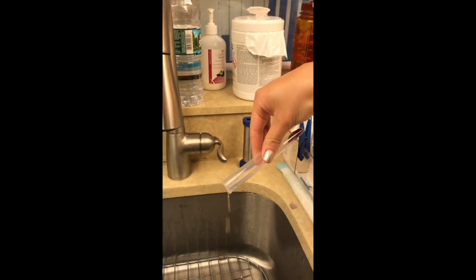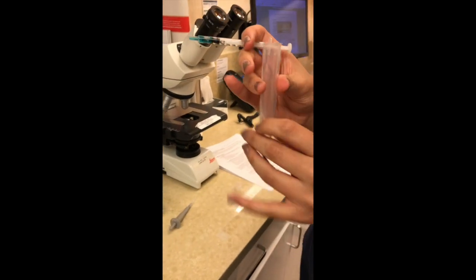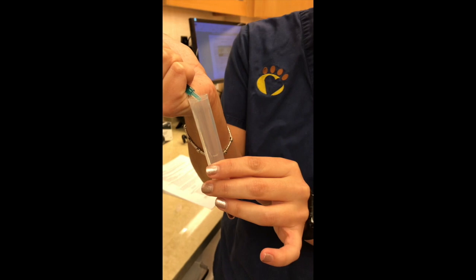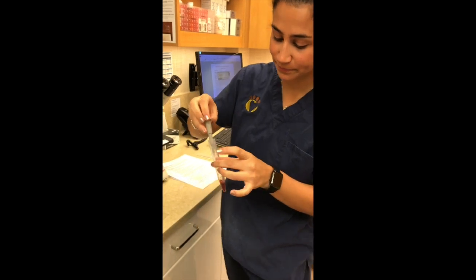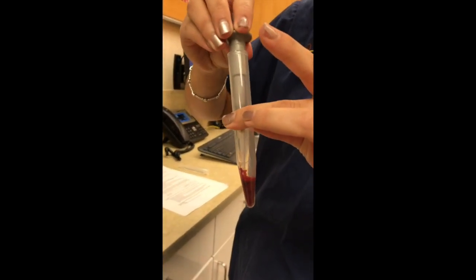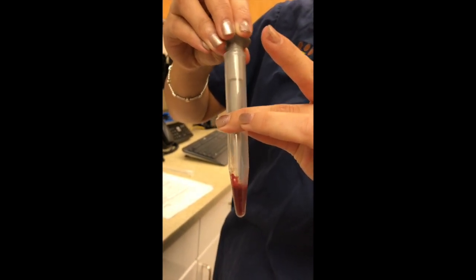Okay, just a little more. Perfect. And now I will add just a drop of our methylene blue to our solution. Okay, so now we're going to be mixing it using a pipette. Just very gentle, doesn't have to be rough. That's it, you're done.